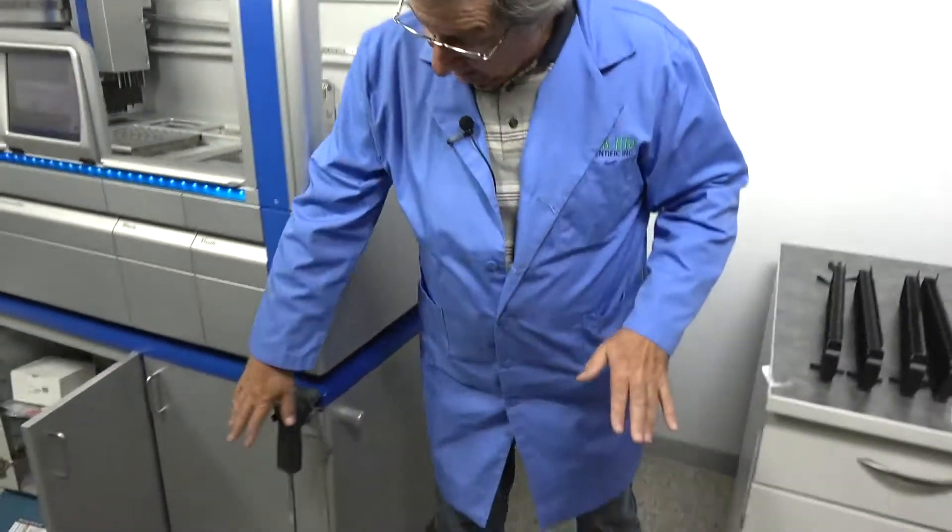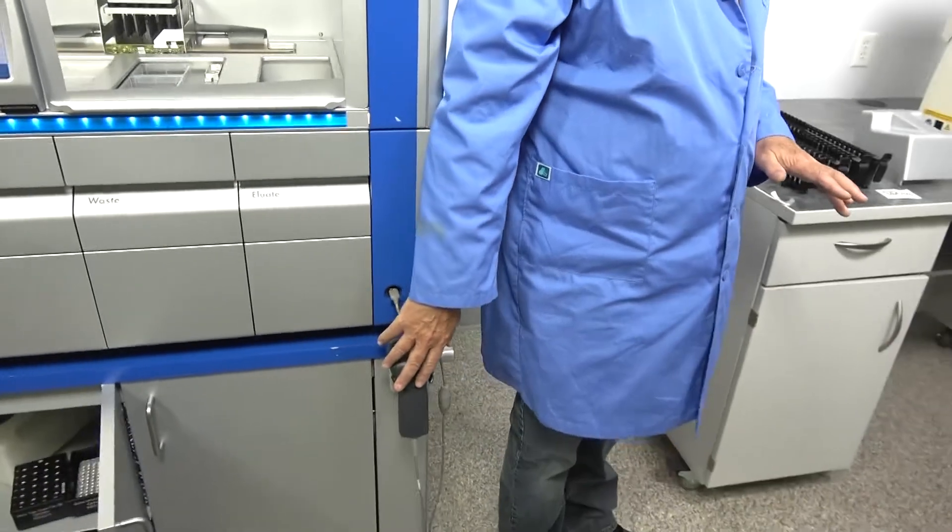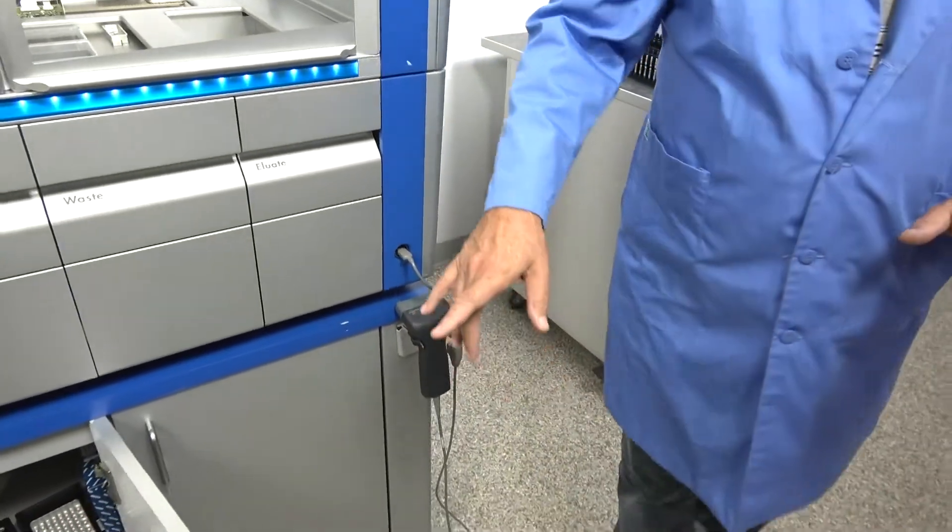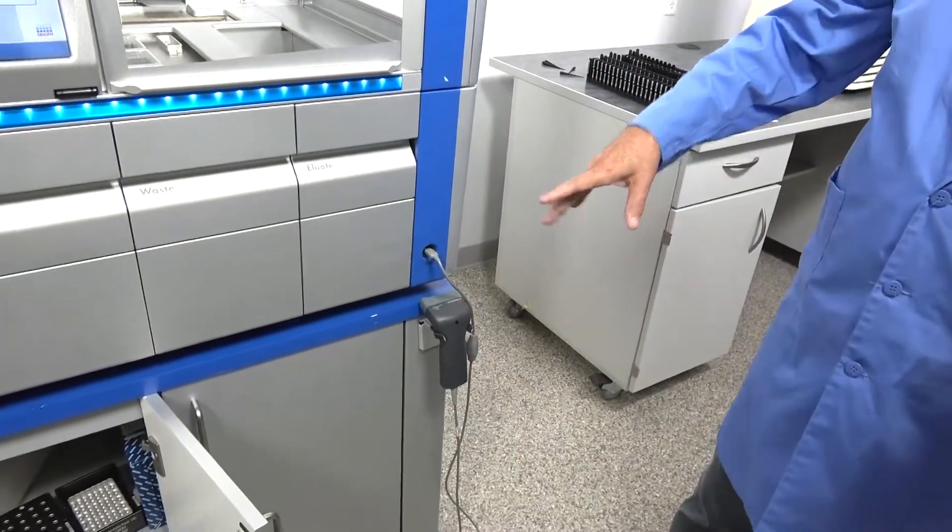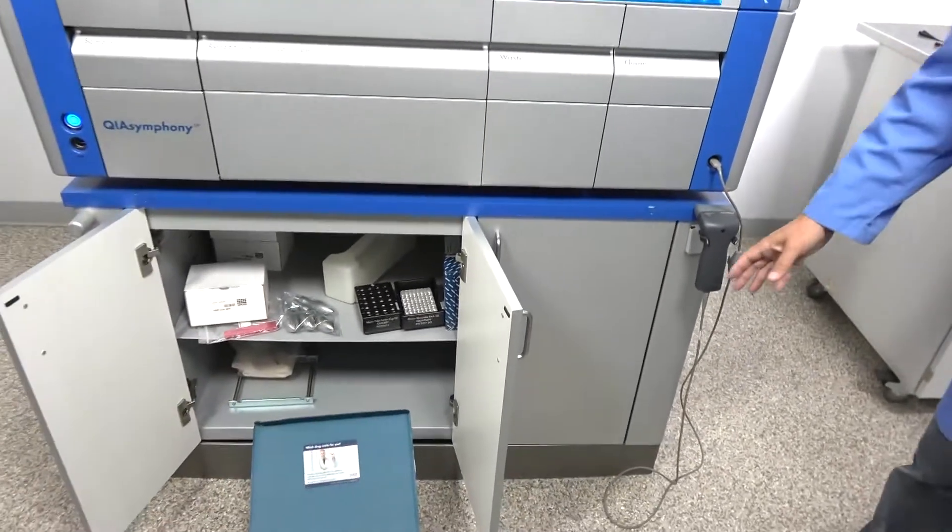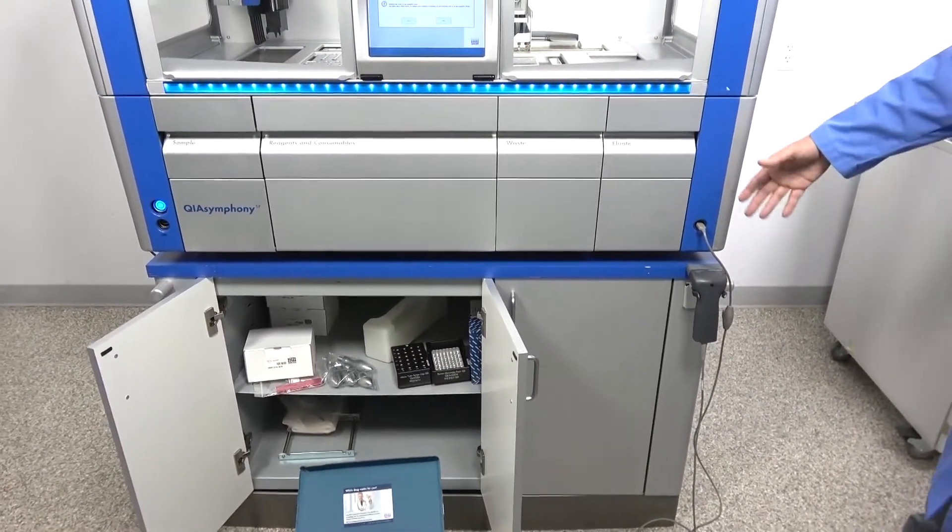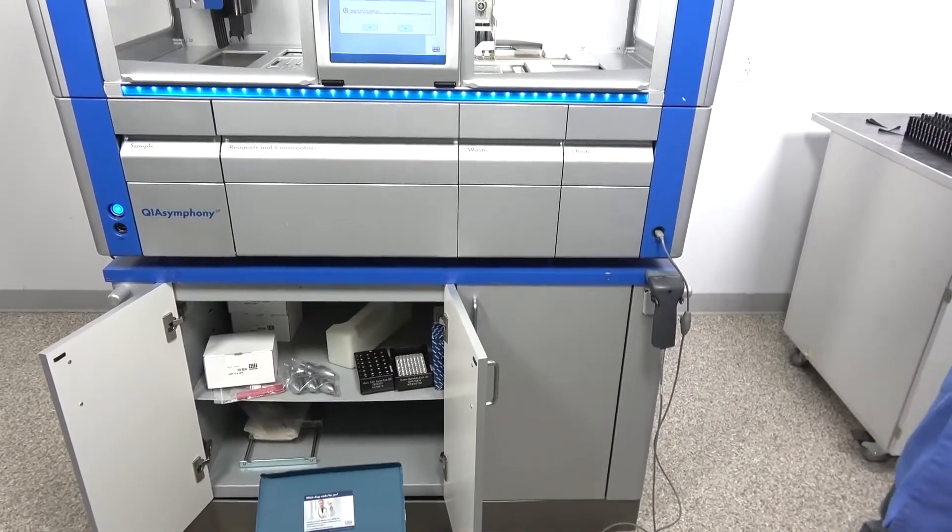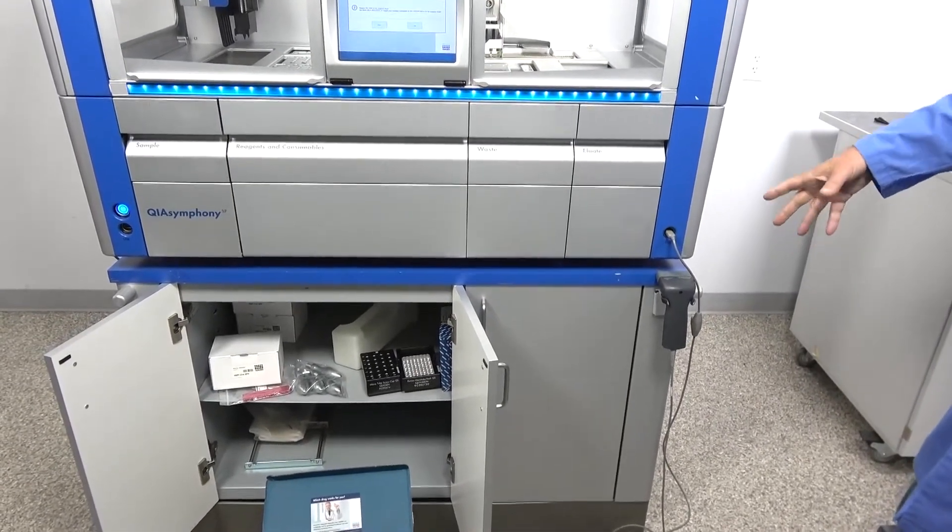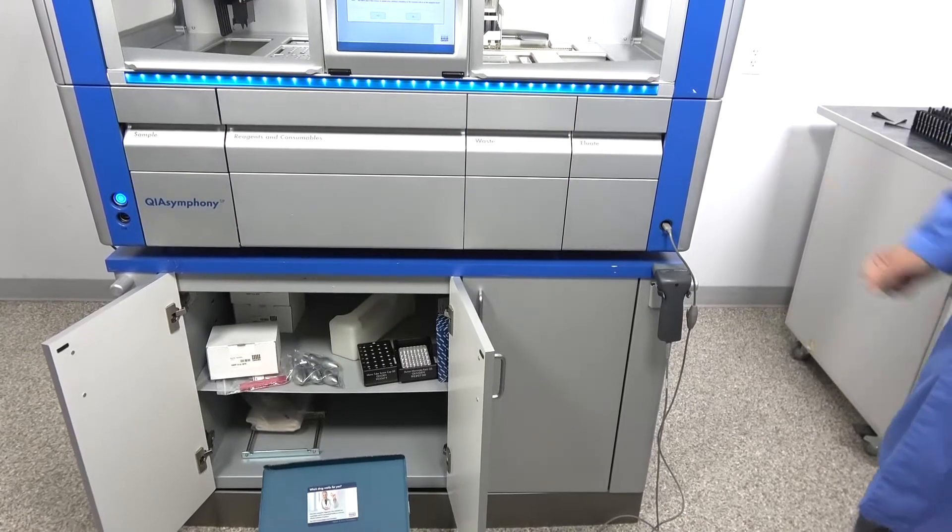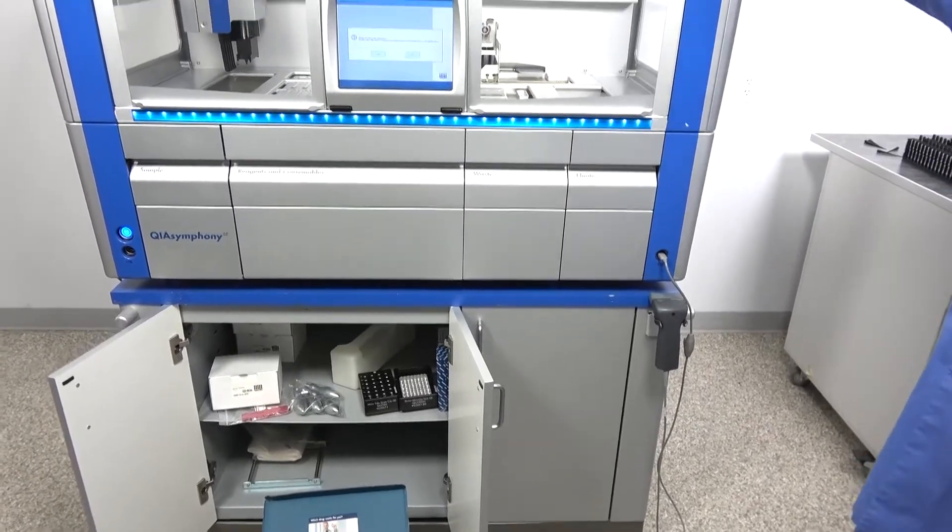And a scanner is very nice to have because each one of your kits, you do scan and it keeps track of all that. Very easy to get these on the open market or through Qiagen. But you're going to want to ask to know what it comes with, so you know what your expense cost is.